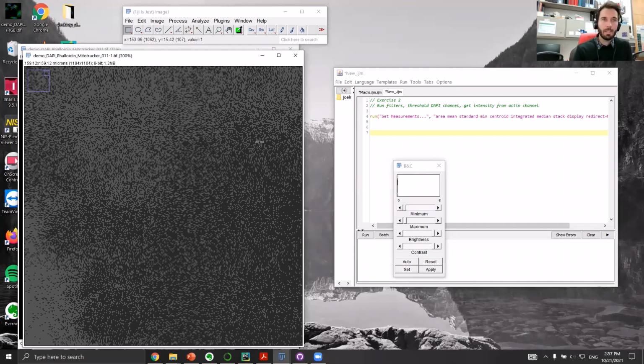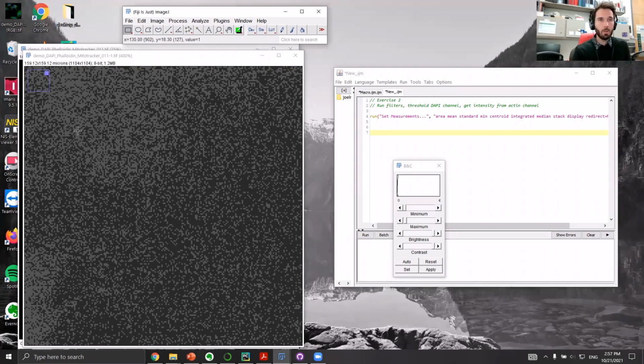One way to do that is by applying something called a convolutional filter. I won't go into too much detail, but what a convolutional filter does is go over your whole image, and for each pixel, it makes a little square, a little circle around it, and applies a transformation to the central pixel based on its surroundings. It does that for each pixel, one, then it moves over a little bit and does the next one, and the next, over the whole image. We're of course not going to program that. There's a function that does that automatically for us, and there are different functions that we can use.